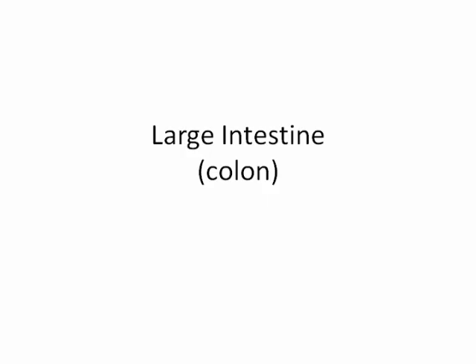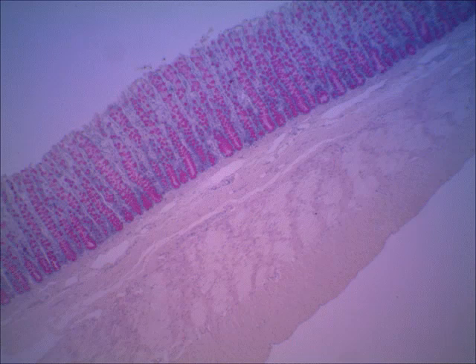The last slide we're going to look at in this section is of the large intestine. Remember, another name for the large intestine is the colon. The colon produces massive amounts of mucus, and these slides have been stained specifically to show the mucus as a bright pink. So you see all those dark pink dots, those bright pink dots?